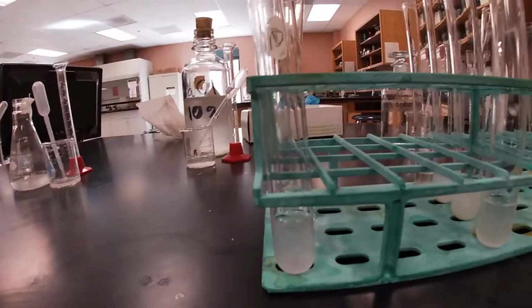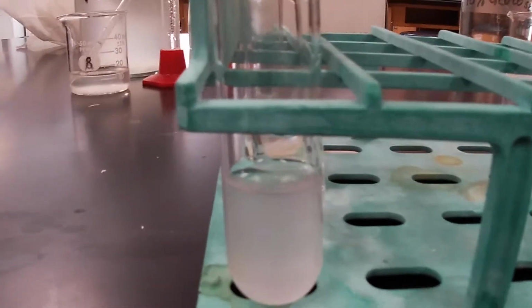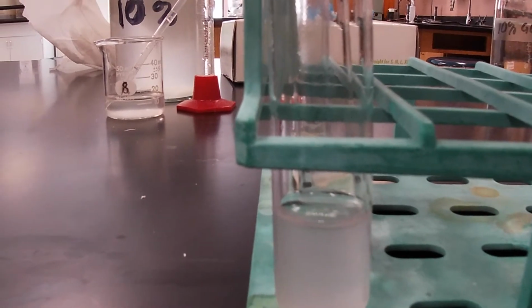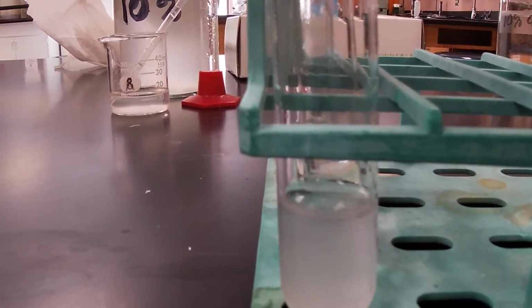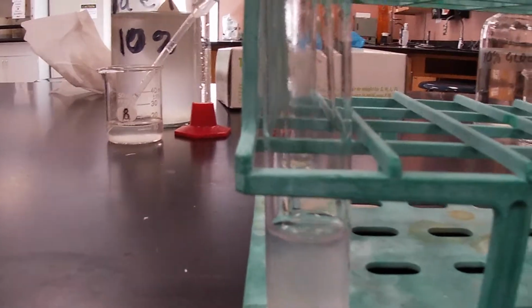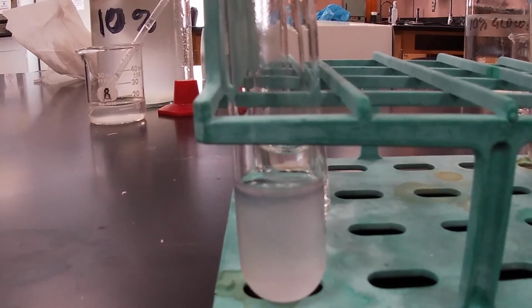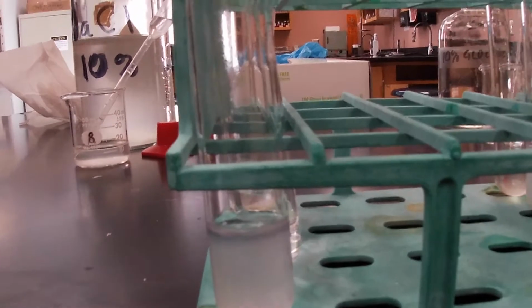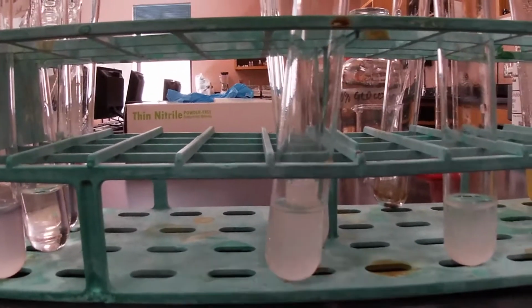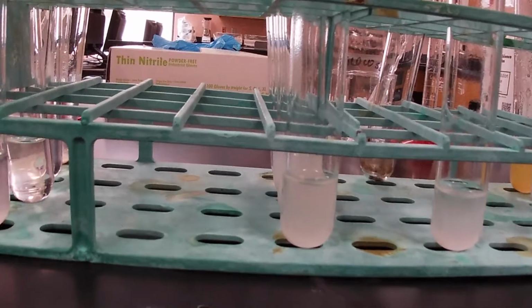Again, let me go ahead and zoom in so that you all can see. We'll zoom and add a couple more drops. So again, starch present using the iodine test inside the contents of the dialysis tubing. Now we're going to go ahead and do our inside contents using silver nitrate.